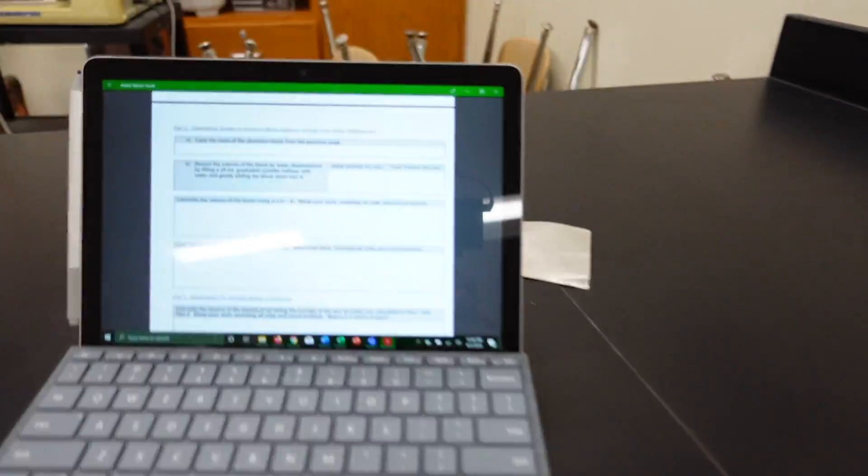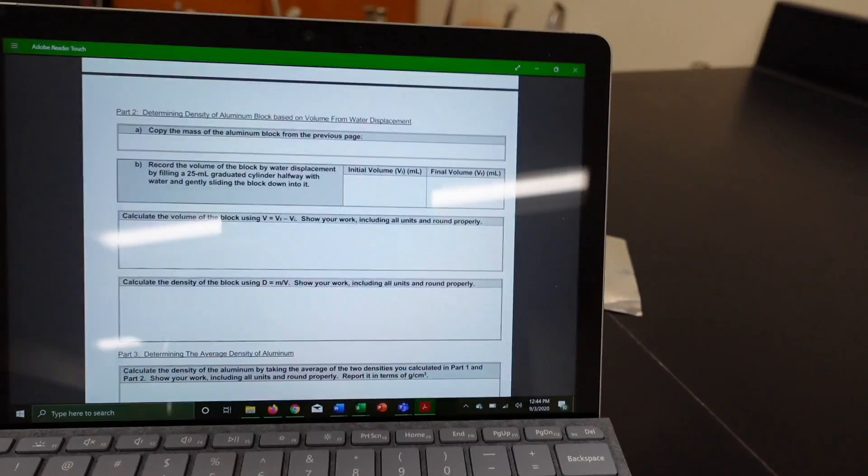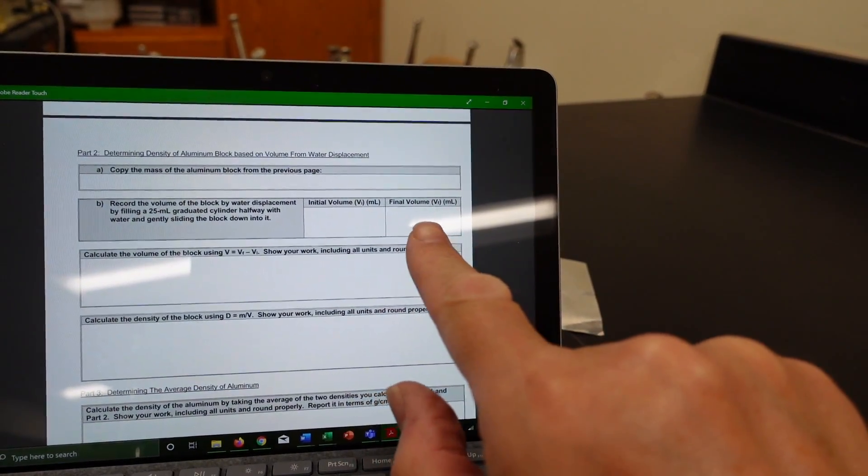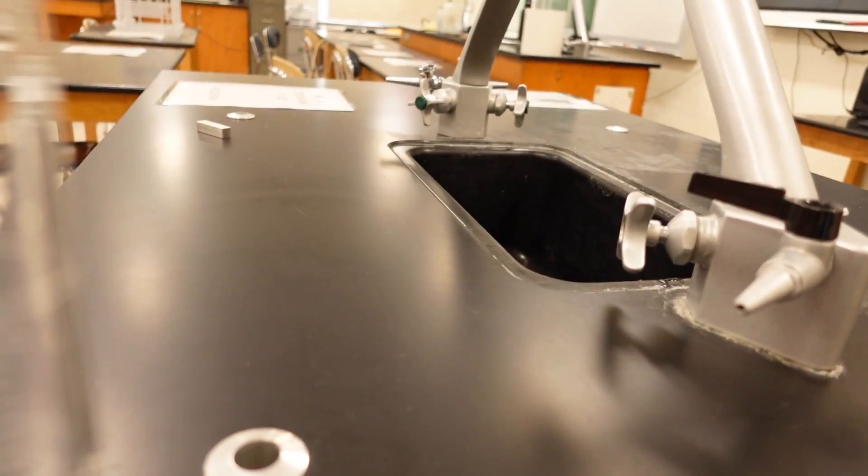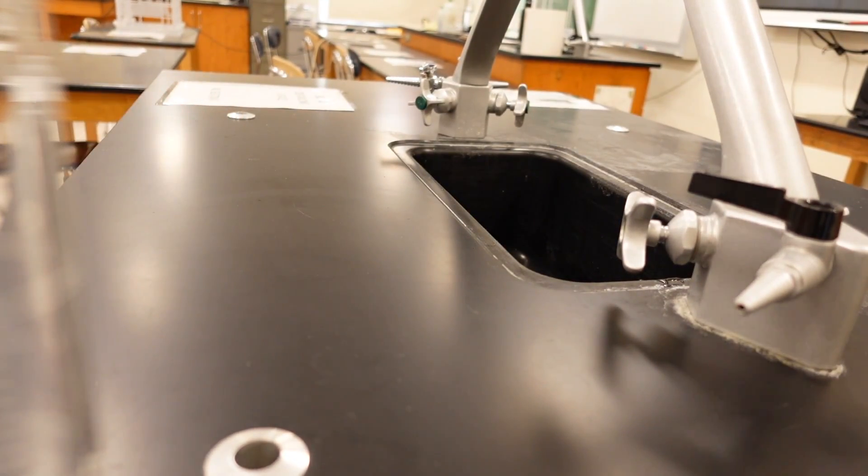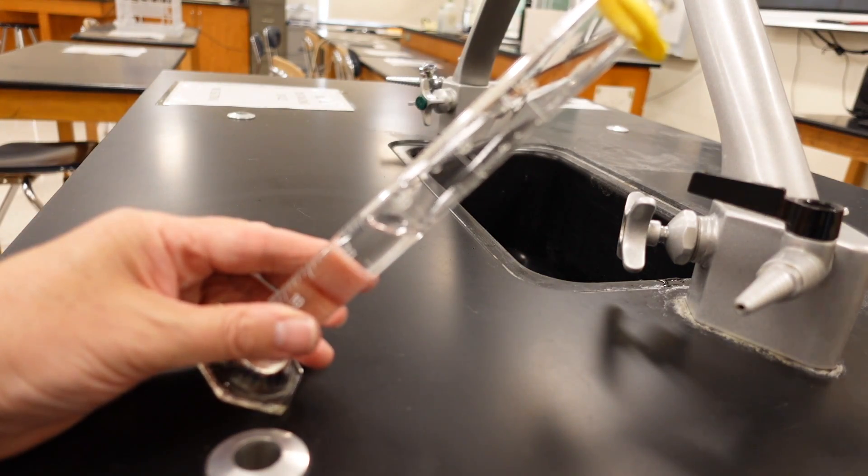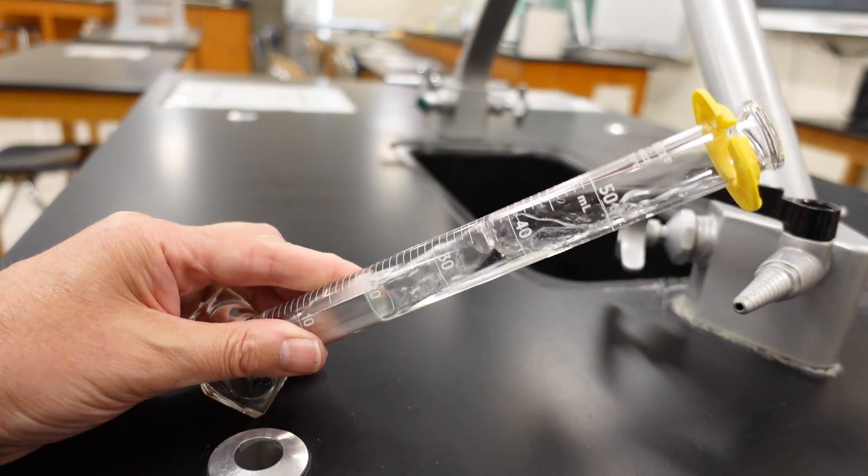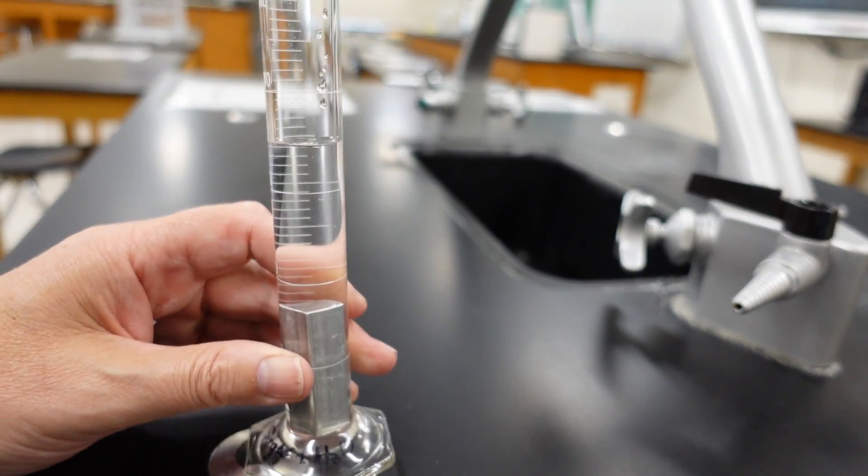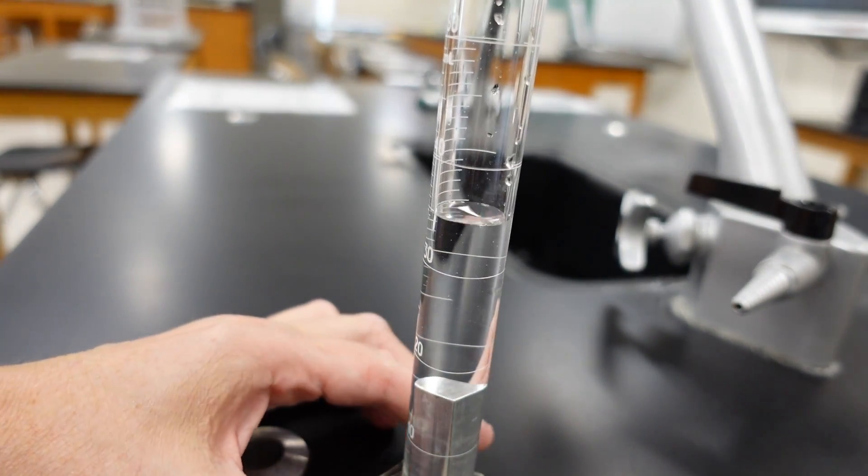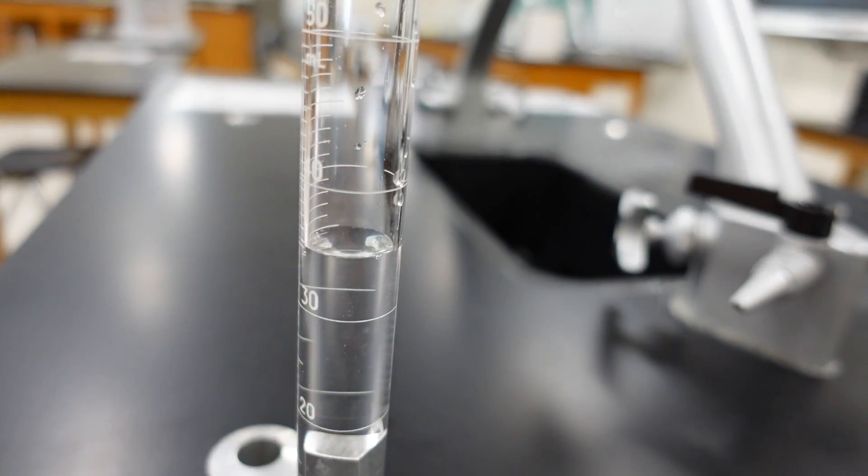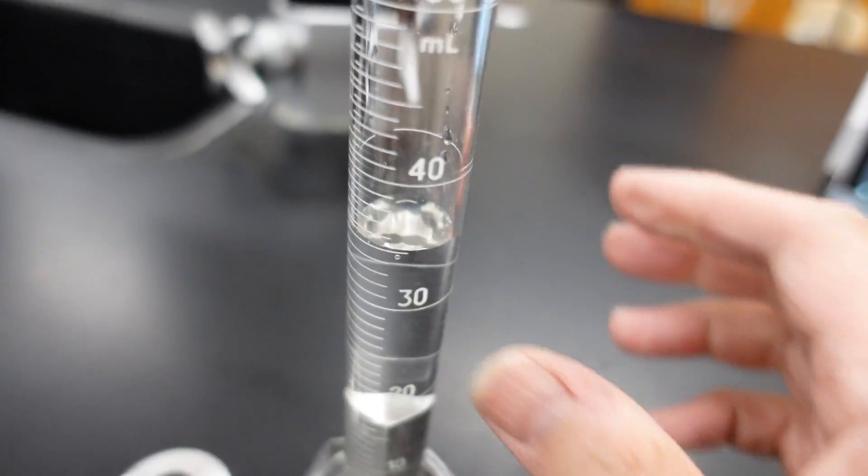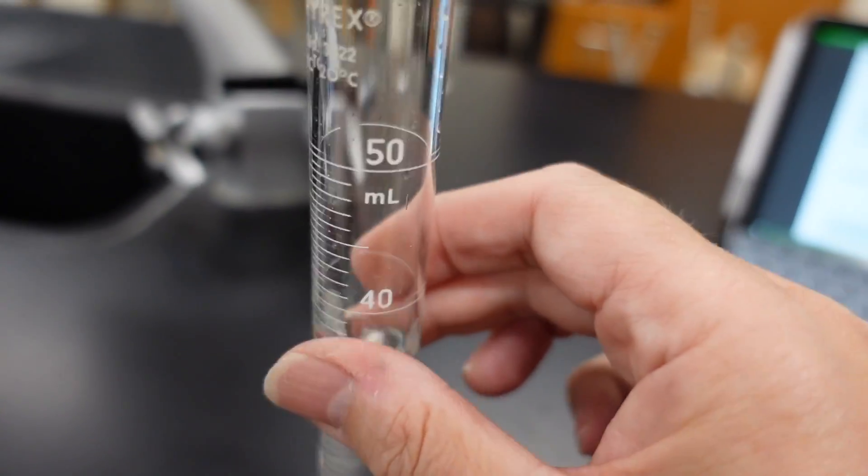Now, we need to slide the block down into it to get the final volume. So, let's do that. Let's slide the block down. Let's try it. Let's see. That way, the water doesn't splash out of the tube. The cylinder, while you do that. Now, I'm going to tap the water bubbles out.